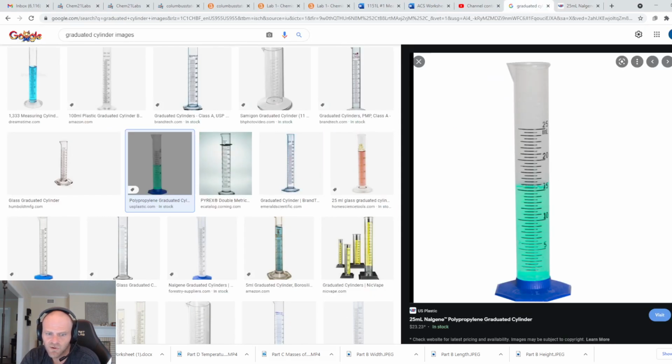Okay. So, as I said, you would add a 0.5 or 0.0, essentially just splitting those increments in half, right? If it's right in between the two increments, you'll split it directly in half. Let's say, for example, this line, I would say falls right in between 15.5 and 16.